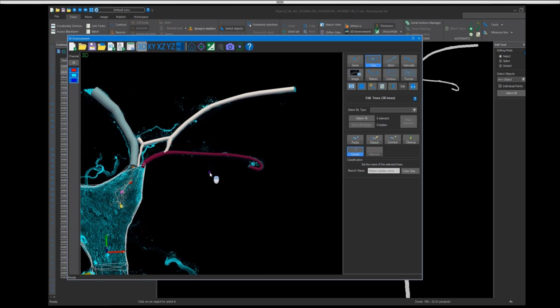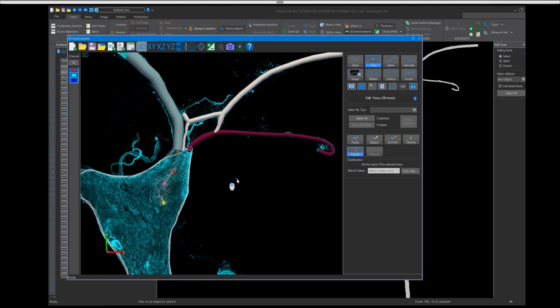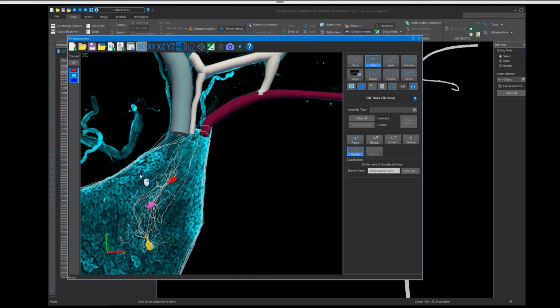And as I select inferior cardiac nerve, that selection turns the magenta color, saying, yes, this is the inferior cardiac nerve. When I save this file, all the points that make up that segment that I've selected will be named inferior cardiac nerve, and they'll receive a persistent and unique identifier that maps back to the ontology. Could do the same thing for whole cells, dendrites, axons, bundles, however you're representing your anatomical structure that's in your sample.